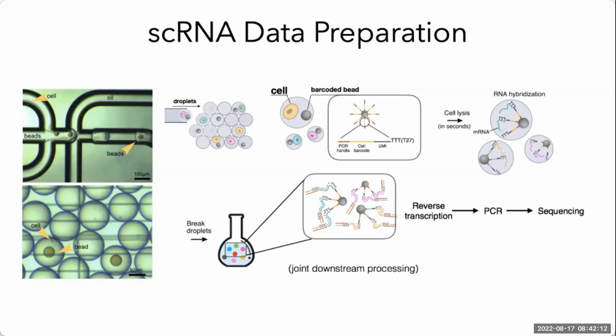There are three widely used options for isolating cells into single cells: microwell-based approaches, microfluidic-based approaches, and droplet-based approaches.